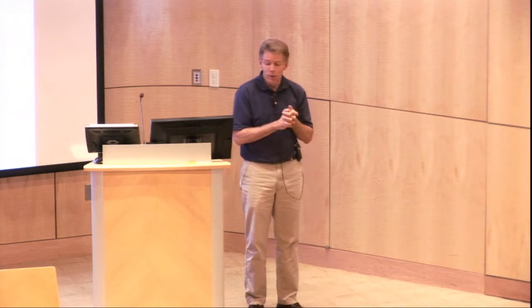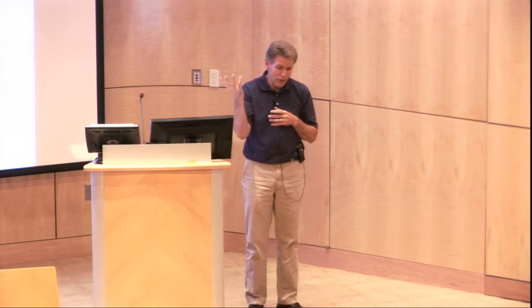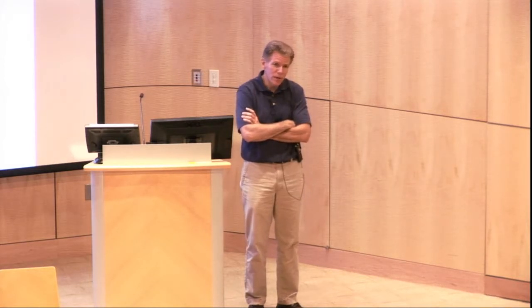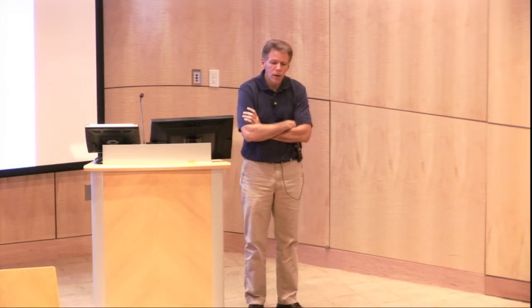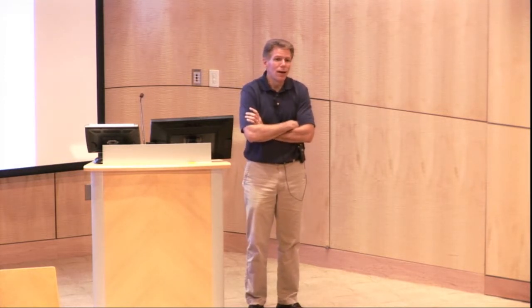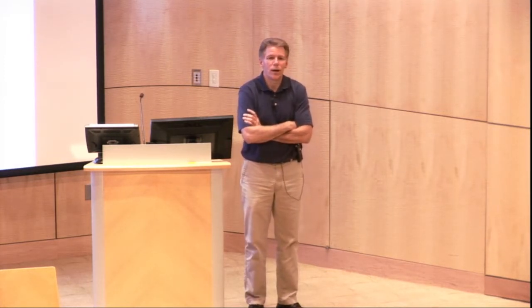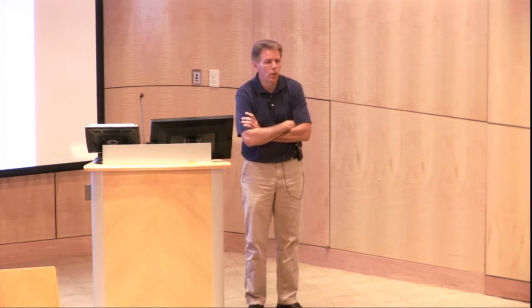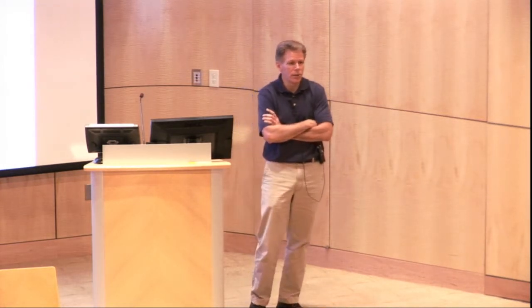That's another actually very good question. I had thought, I forgot to do it at the last minute, I was going to put in a slide about our recent experience in phase 3 of the 1000 genomes. So in general, our belief was the more samples, the merrier. Although when I got to phase 3 of 1000 genomes, I called all 2,500 samples together on chromosome 20. And I saw that our sensitivity seemed to be dropping a little bit. We weren't recapturing some of the sites we had called in phase 1.